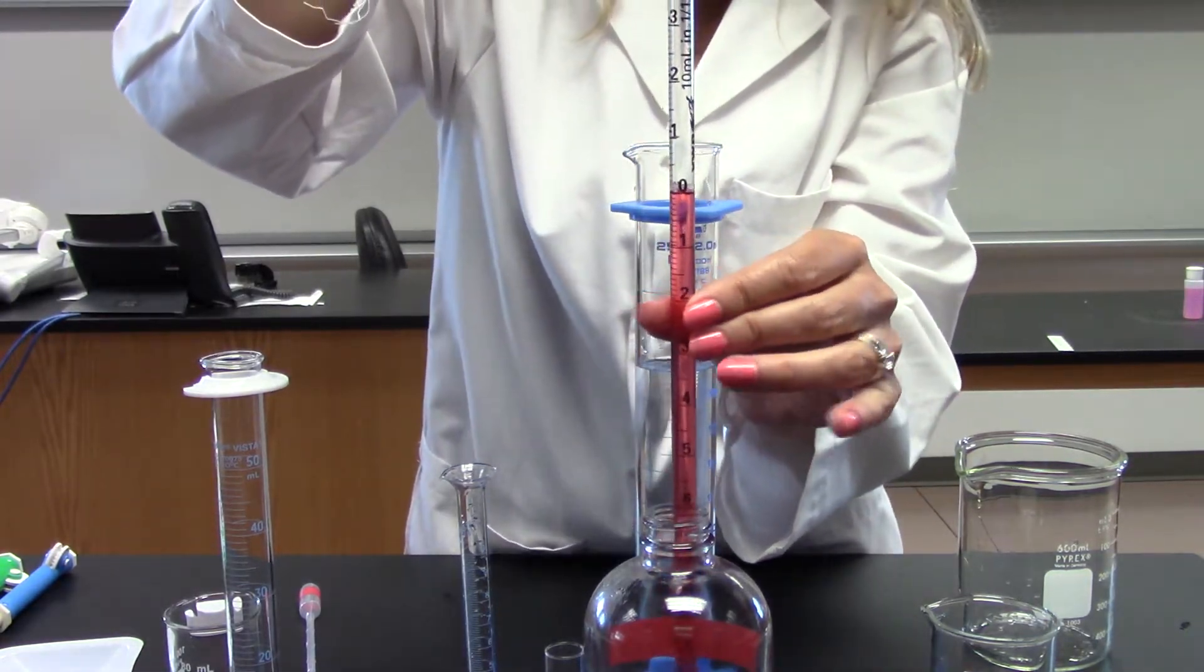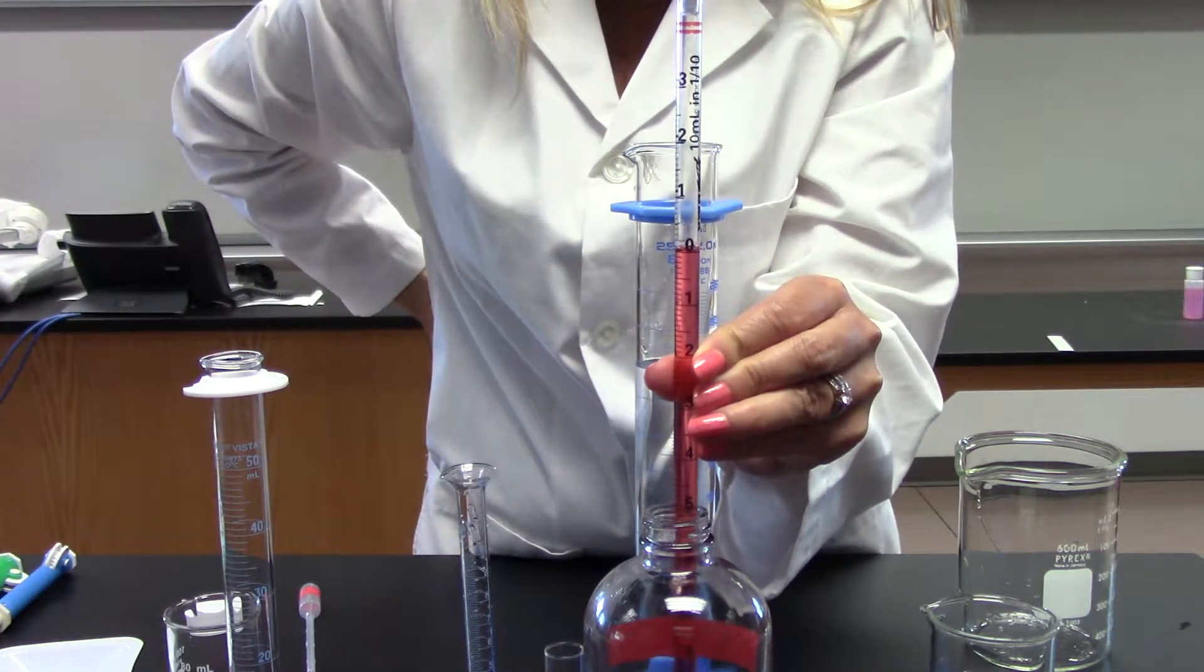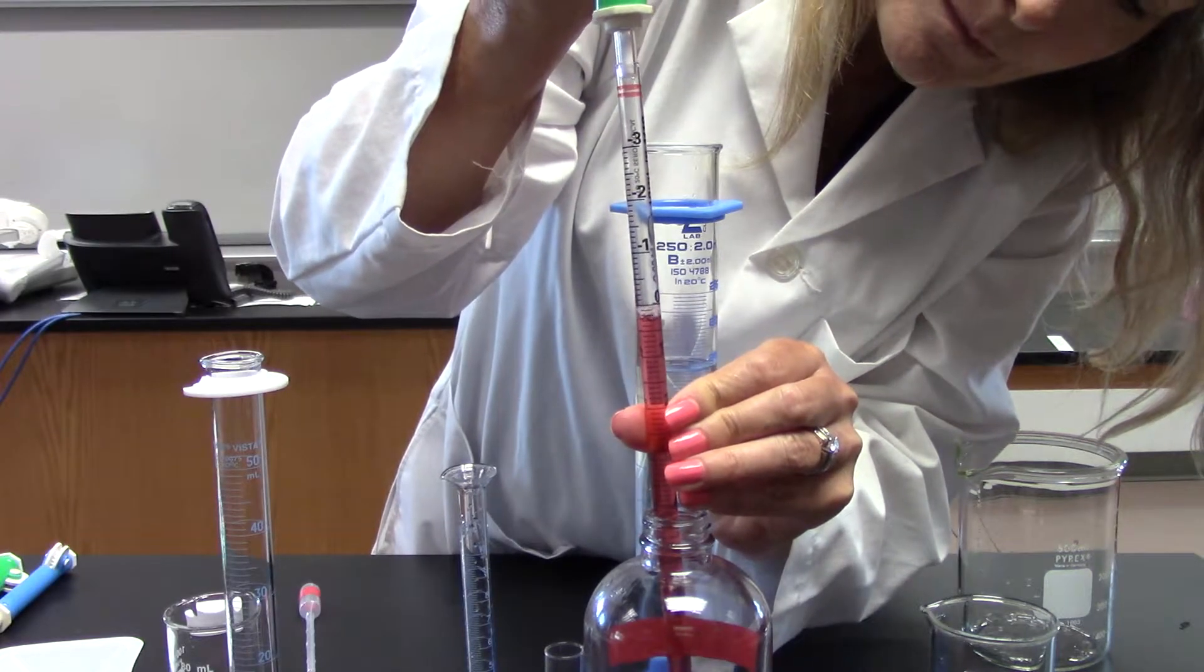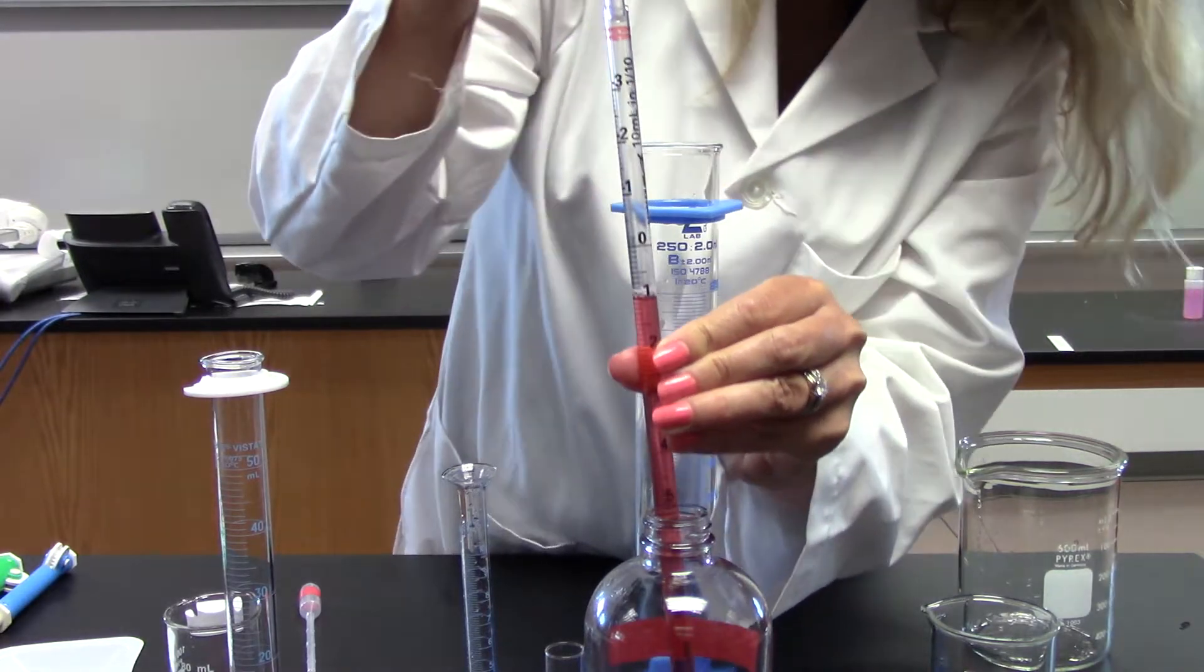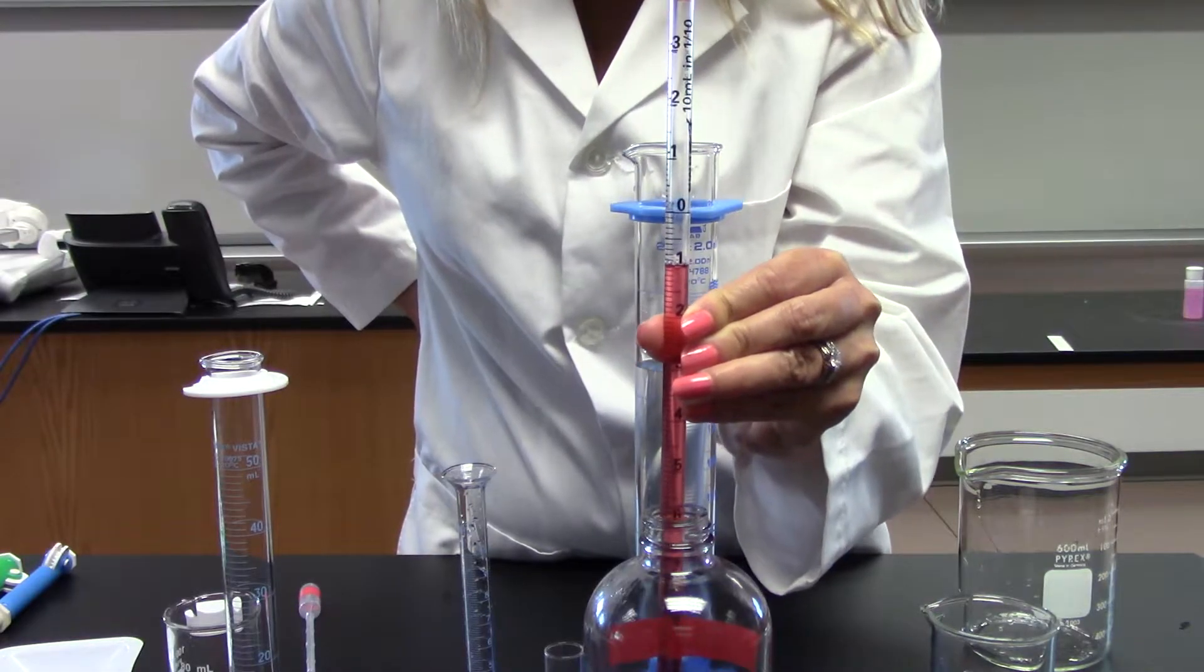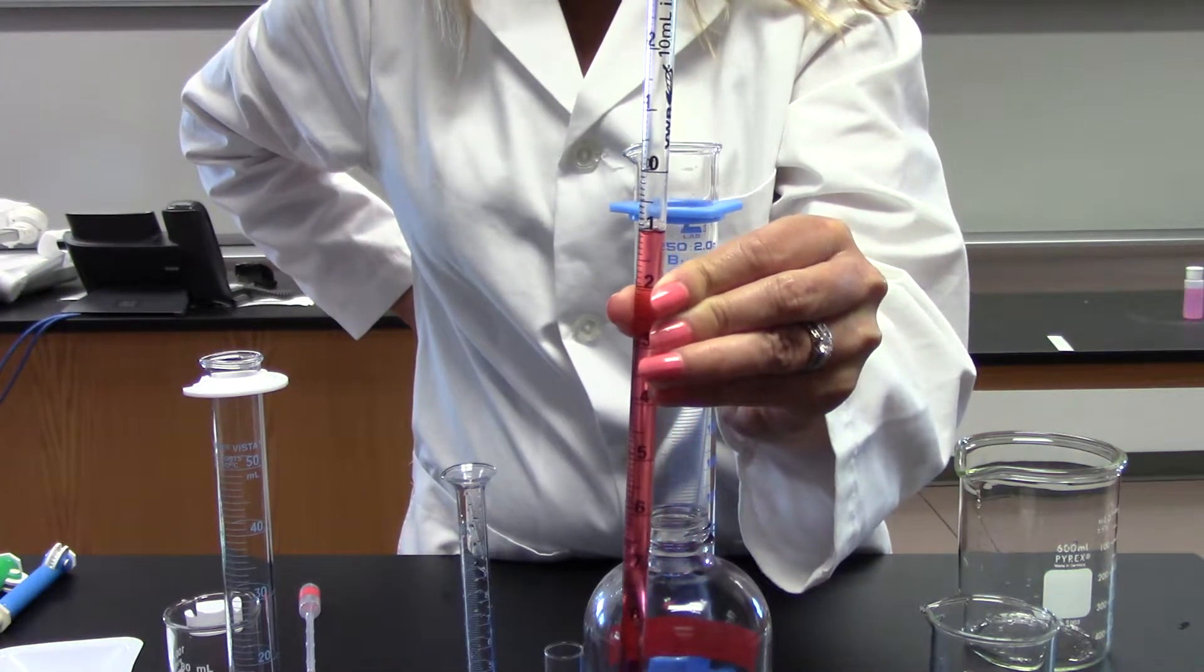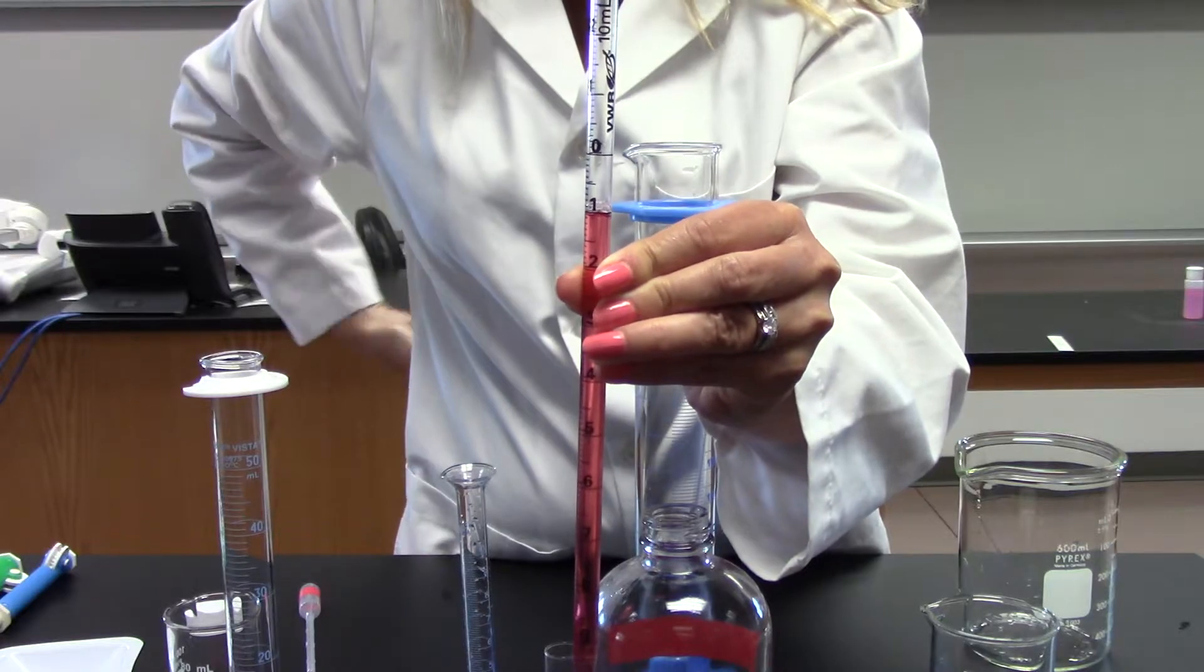It's important to realize though, when I'm at the zero, I don't have zero milliliters of liquid in here, I actually have 10. And if I dispense one milliliter, I don't have one milliliter in here now. I've dispensed one - I did have 10, so now I have nine. So this shows that I have dispensed one milliliter, and that's really the purpose of those reversed graduations.